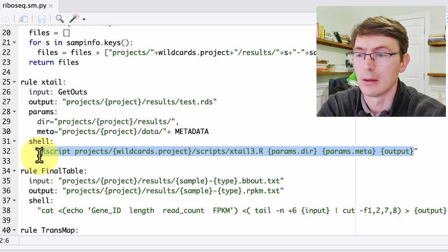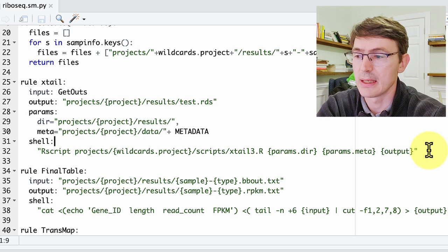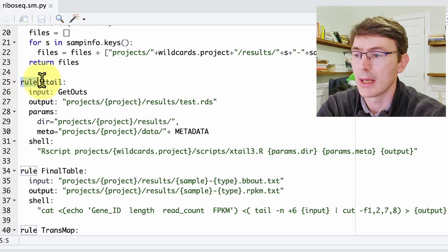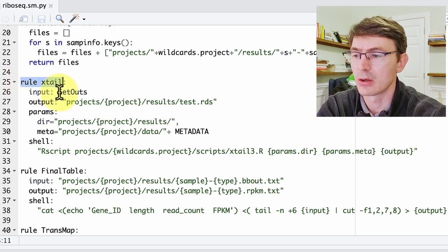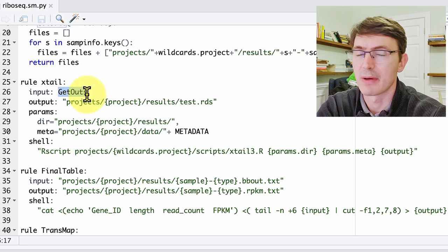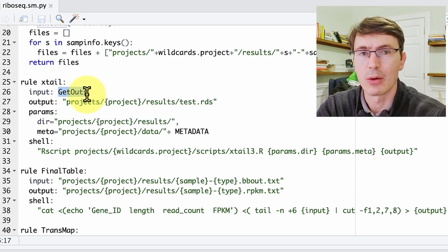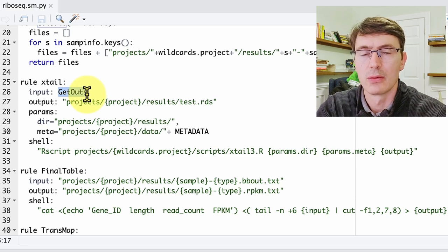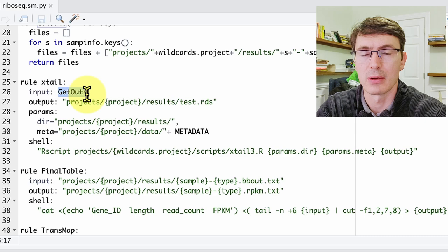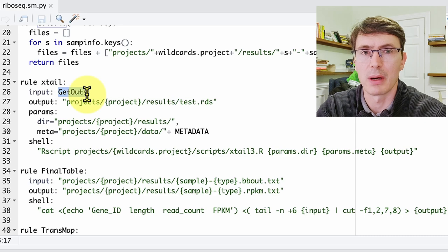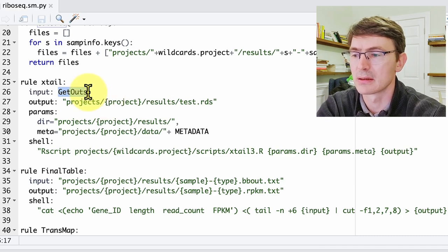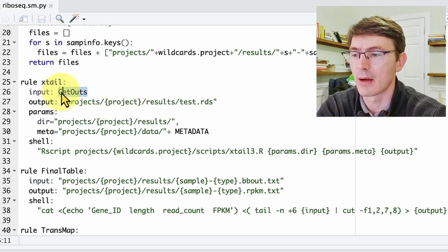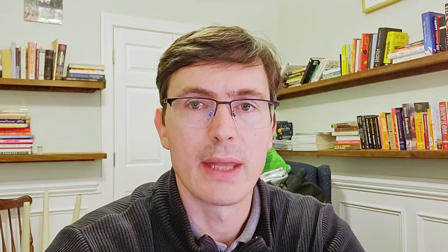In any case, from the perspective of building the pipeline, this rule xtail is probably the most complicated because we have to have as inputs all these count tables from the different FASTQ files, both for the ribosomal-bound RNA and the total RNA. And that's where we have to define this function here.